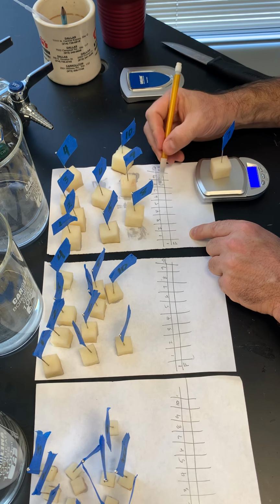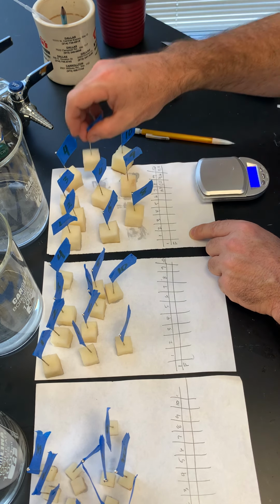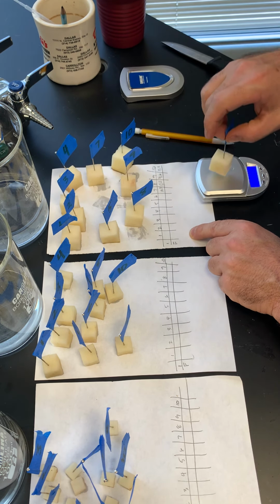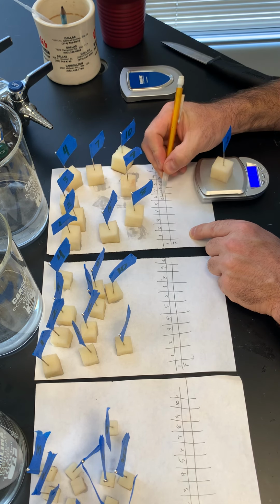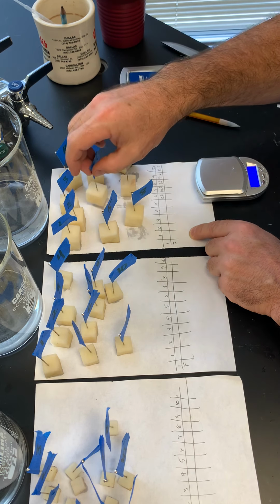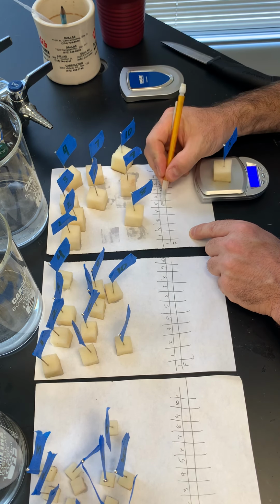7 is 10. And I'll show you how you can get, and I know you don't have a scale. Most of you guys don't have a scale. I'll show you a way that you can do this without having a scale. If you have a scale, you can use it. 10.6. Scales just make it really convenient. 10.2.